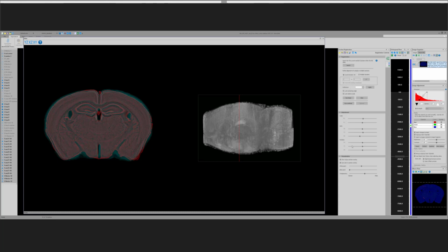rotation. So these are the parameters that allow us to move within the Allen space. Shifting, these are just straightforward shifting in the XY positions and Z. And then these are rotations. So this allows us to move.